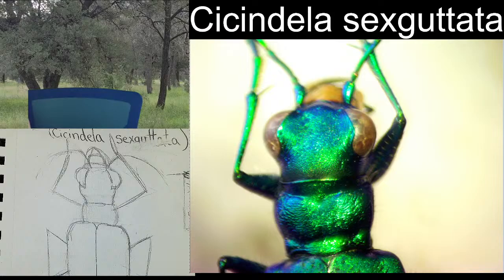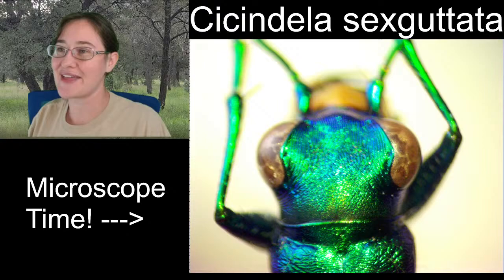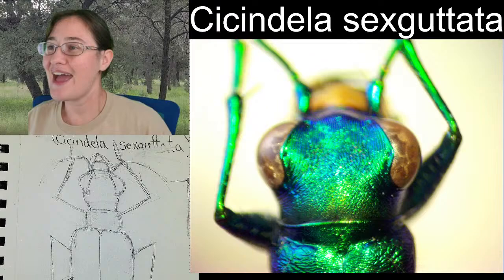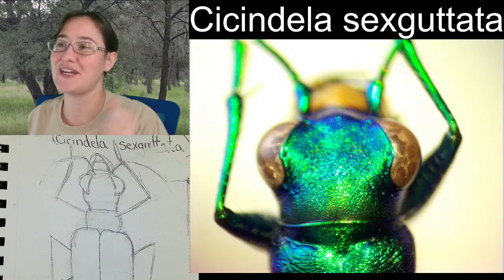So I just tried to move our specimen over a little bit, straighten it up. I'm going to zoom in on it so that we can see. Yes, that's what I wanted. So you can see the metallic greens and blues on this six-spotted tiger beetle, and you can also see some of the texturing on the exoskeleton. I believe you would just call those ridges. They're not straight. A lot of times when we say striations, they're straight. I think they would just be called ridges, but to me it has always looked like somebody took their fingerprint and put it on the head of a tiger beetle.